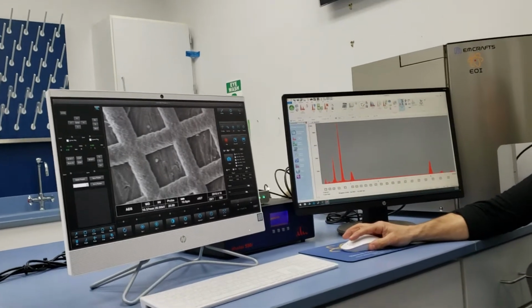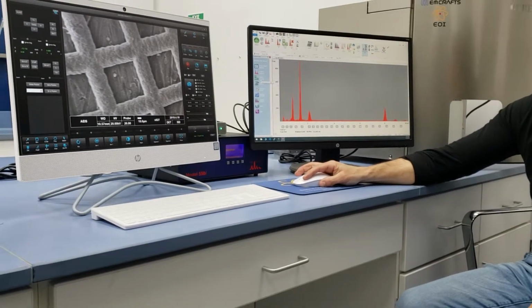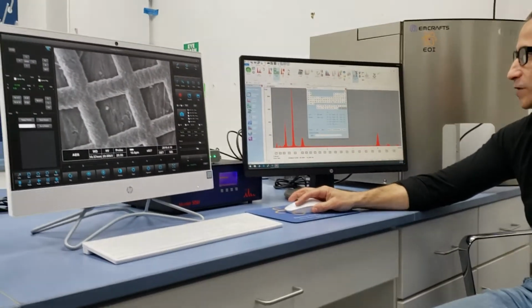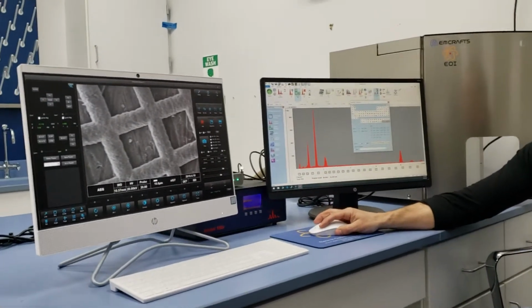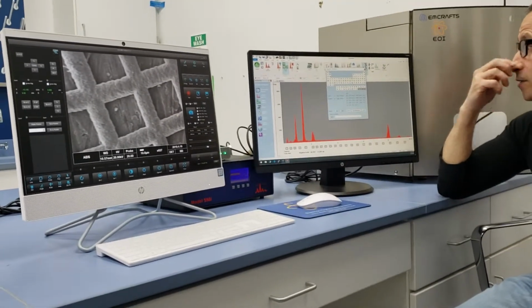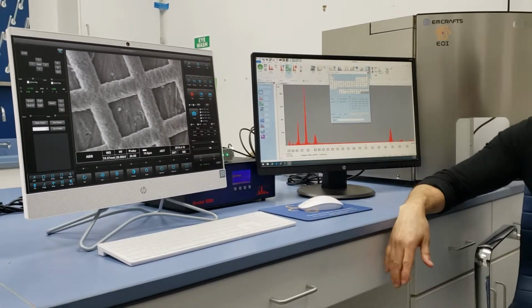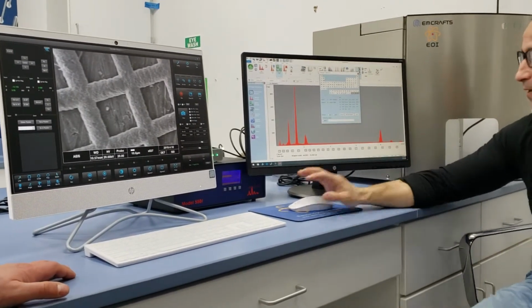So the next feature in our flowchart pull down is called what? ID the element. So click on that, and that opens up a periodic table. And I can move my periodic table around if I want to, wherever I want. So there's a periodic chart. So there's 5 different ways of labeling this information. We're going to go over all the ways to label your spectrum.